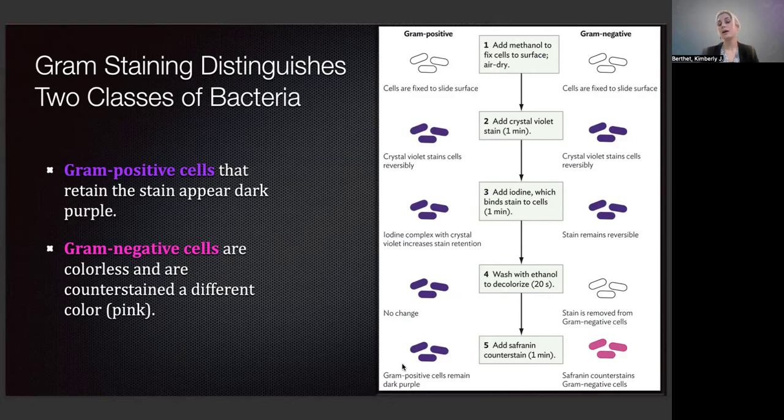It may render an antibiotic completely useless if we're using one that targets a gram-positive cell and treating on a gram-negative. It wouldn't work. So clinically, it's extremely important to know whether a sample is gram-negative or gram-positive. And all cells essentially fall into this gram-negative or gram-positive categorization. There's a couple minor exceptions where the gram stain doesn't work well, but most all cells fall within this categorization. So it's a really easy way to do a diagnostic approach and to start clinical treatment. Let's go ahead and walk through the steps on a gram stain.